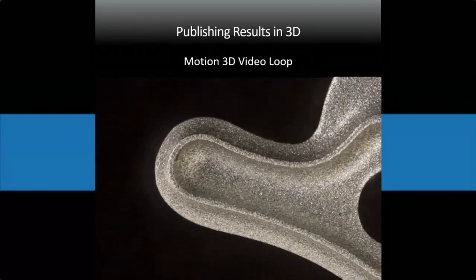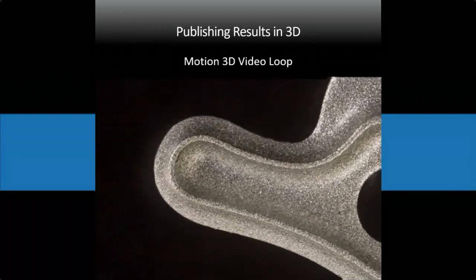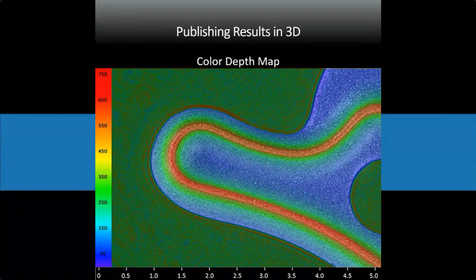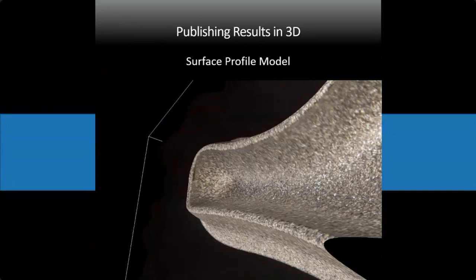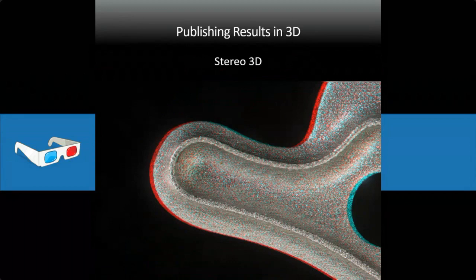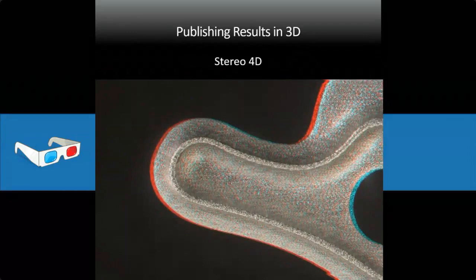You can present results at meetings or send them as links in your publication. You can also present the results as a color depth map, which shows you the measurement of the object in X, Y, and Z, giving you a quick quantification at a glance. Another way is a surface profile model, which you can tilt in pretty much any direction. And another way is stereo 3D — if you have stereo glasses with the red on the left eye, it pops out at the screen. There's also a 4D mode that combines both stereo and motion parallax simultaneously.